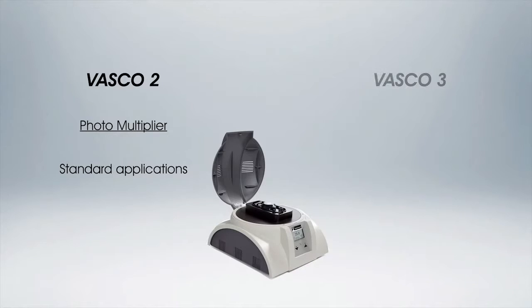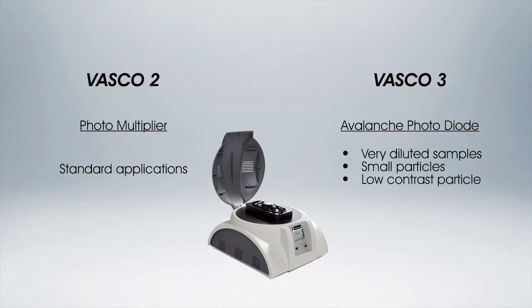Vasco 3 is equipped with a selected high-sensitivity avalanche photodiode detector for very diluted samples, small particles, low-contrast particle-like proteins or micelles.